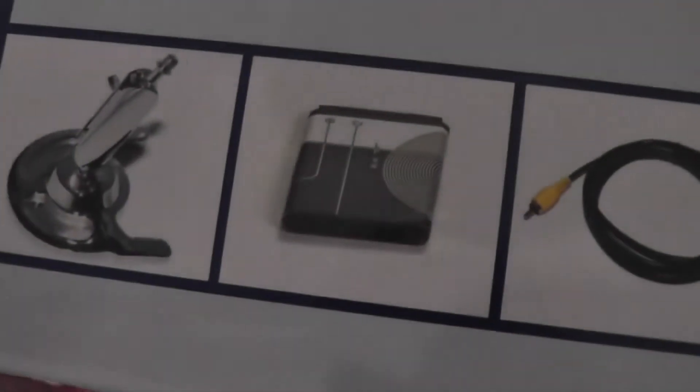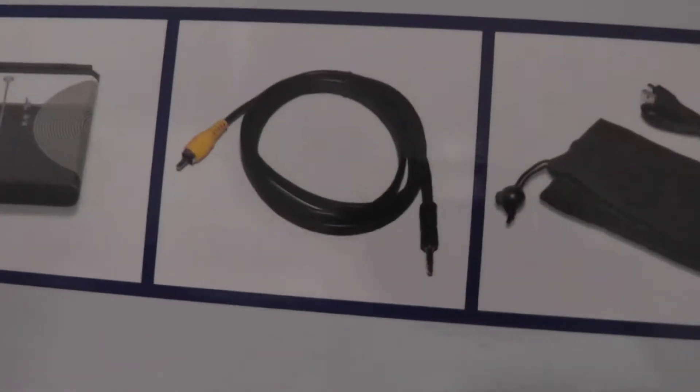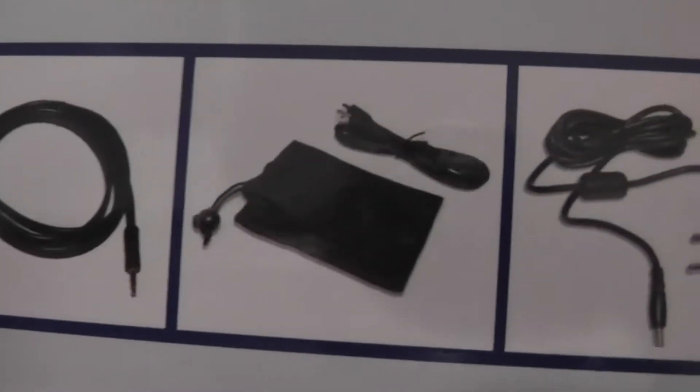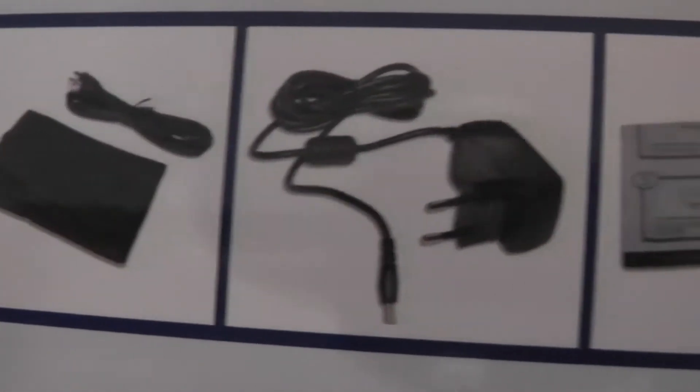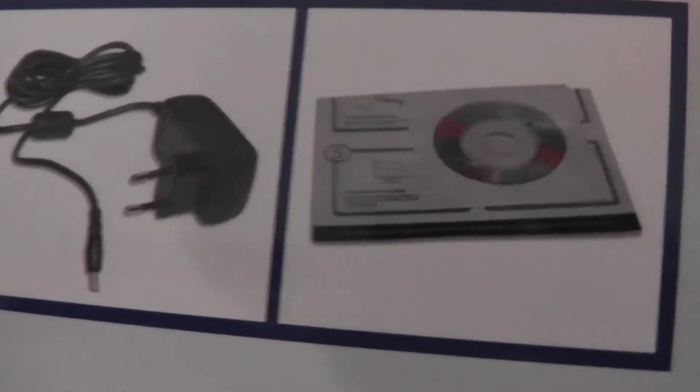Here is the device. You see that this is the traditional stand. This is the battery, kind of Nokia-inspired. There's an AV outlet cable to connect to a television or monitor, a carrying case, an AC adapter, and the software and installation manuals. That's about it.